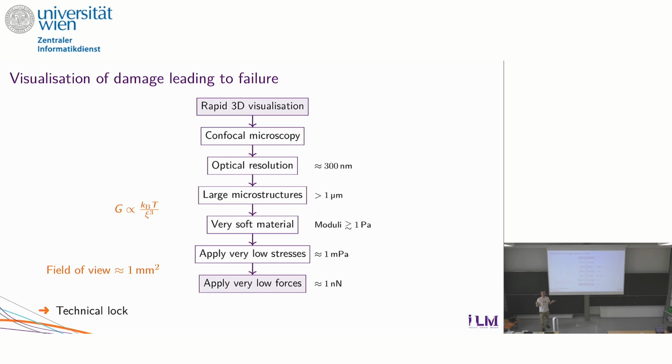Good rheometers can do that. But they will do that on tens of centimeters square areas. The issue is, if you want to know the relationship between the damage you would observe and the nucleation of fractures, if the fracture is nucleating somewhere in your centimeter square bulk, and you're looking just at the millimeter square, that's basically the scope of your microscope, then you'll have to do 10,000 experiments before you observe something going on where you're looking.